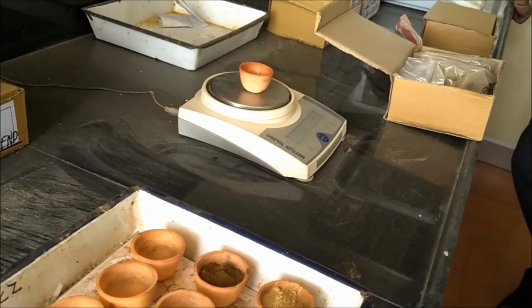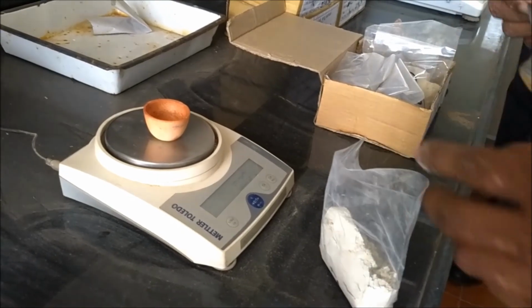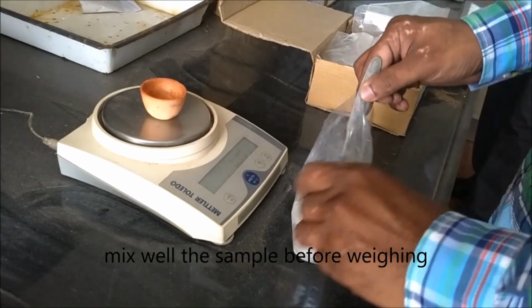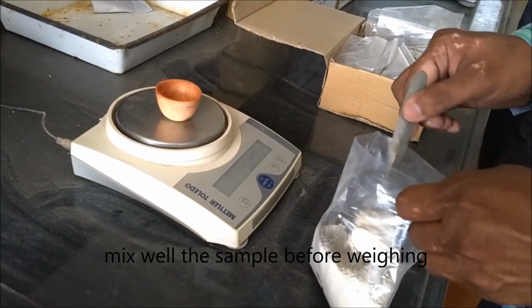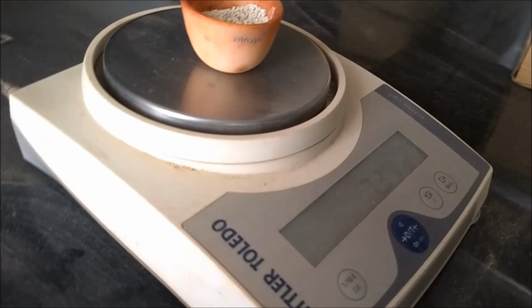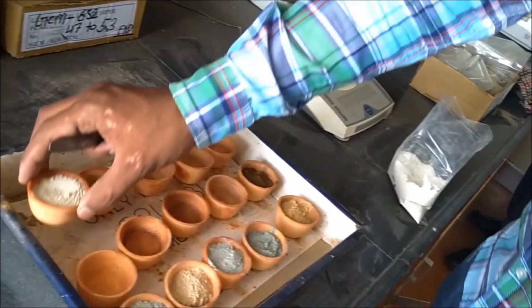So for roasting, we first have to weigh. Place the crucible in the weighing balance, tare it, and mix thoroughly the sample from the container and weigh 20 grams of the sample in the crucible. This large 20 gram portion will take nugget effect and homogeneity into consideration and will represent the whole sample.